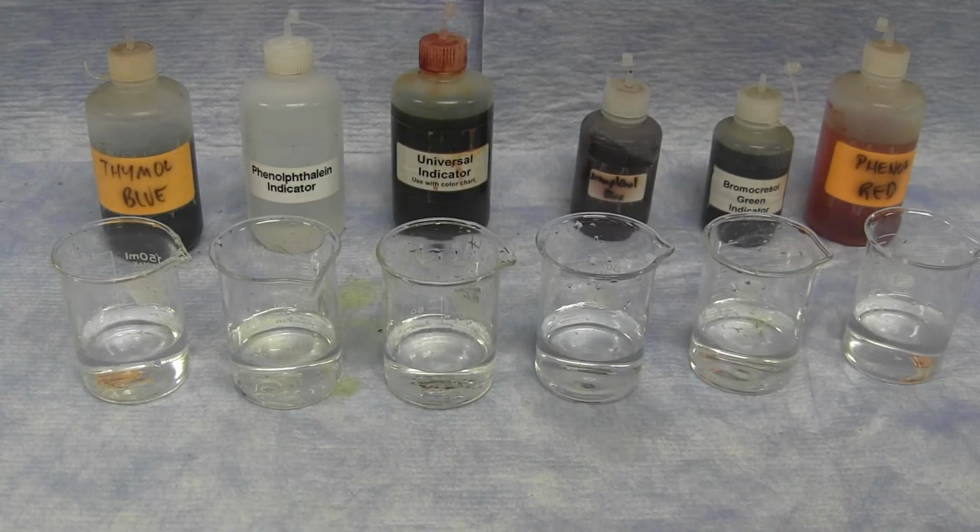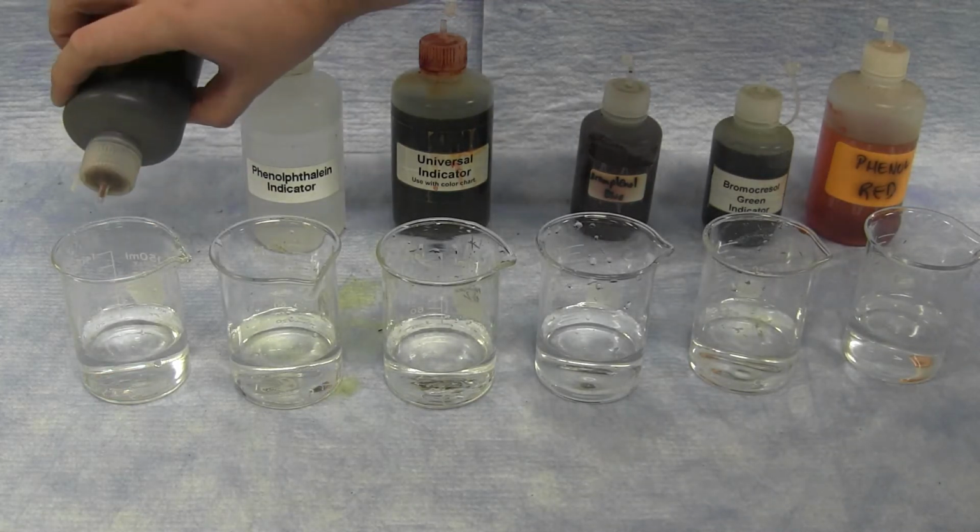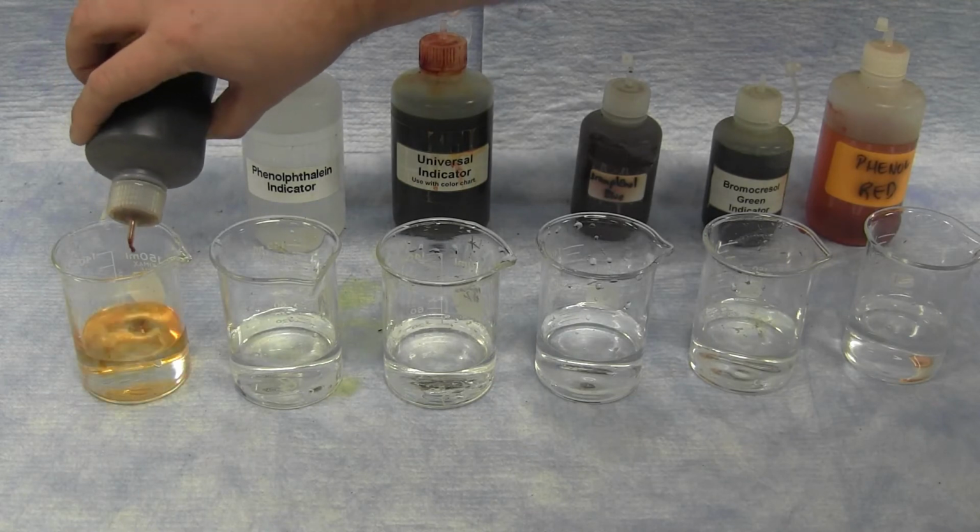All of these beakers contain the same approximate amount of 0.1 molar acetic acid. The pH of the acetic acid is about 2.3.